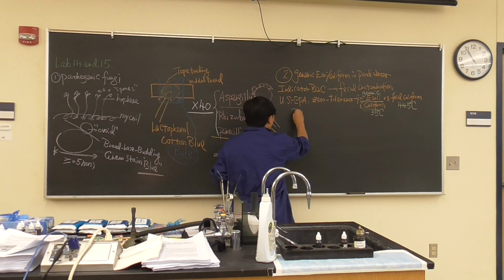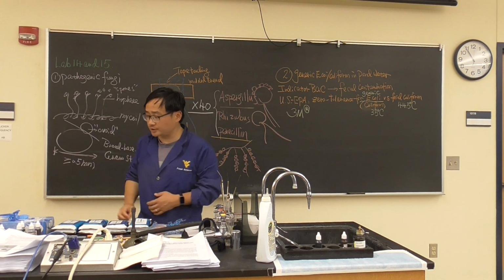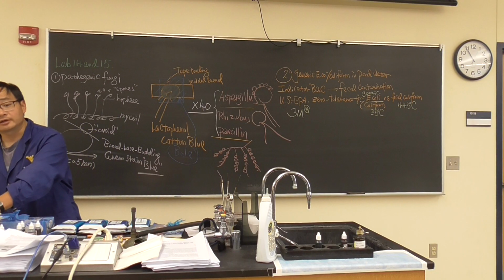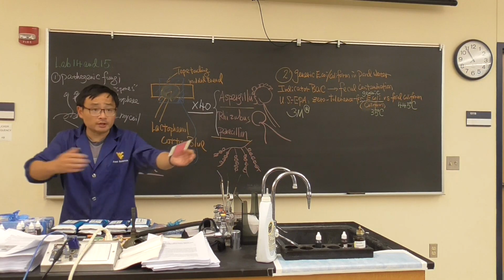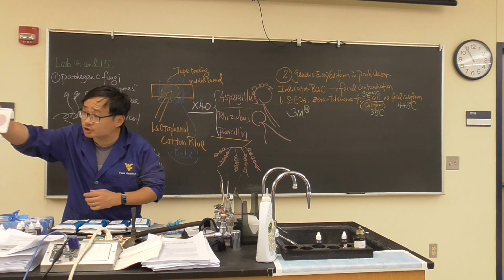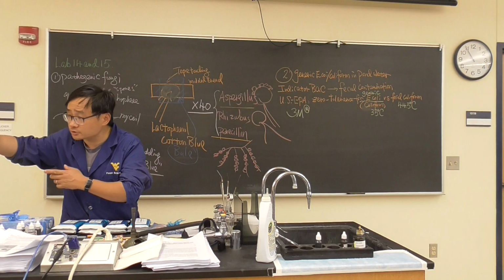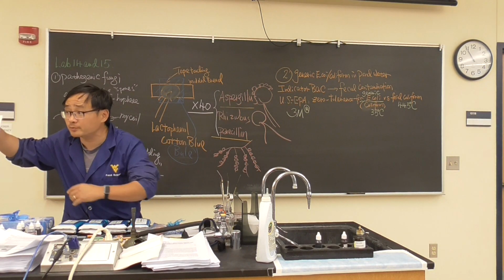Then, a company called 3M. If you're working in a microbiology area, you will know this company. This company created a very magic media. So today, you didn't see any agar. We talked the whole semester about agar plates. And what you see is a very magic tool. This is a paper media, because it concentrated all the nutrients in this piece of paper.